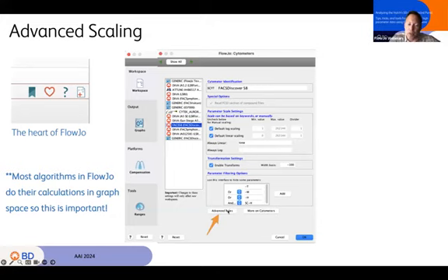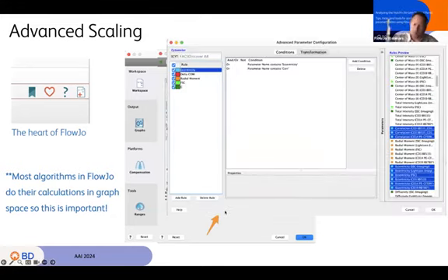Next, new is this advanced rules button. If you click that, it opens up this screen here. And the gist of this is that you can click add a rule, and call it something. Here I'm showing S8 data again, because there are so many different parameters in this data and they have different ranges. For many cytometers, one preference for linear scale parameters and one for log scale parameters is fine. That might work on just the previous screen. But if you've got any of these image-derived parameters, they've got different ranges. Maybe you want to set them, or maybe, like me, you're just fastidious about wanting different scales for forward and side scatter. Anyway, the gist is you'll hit add a rule, and you'll call it something.